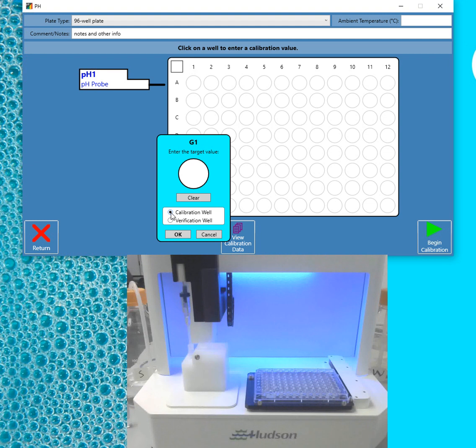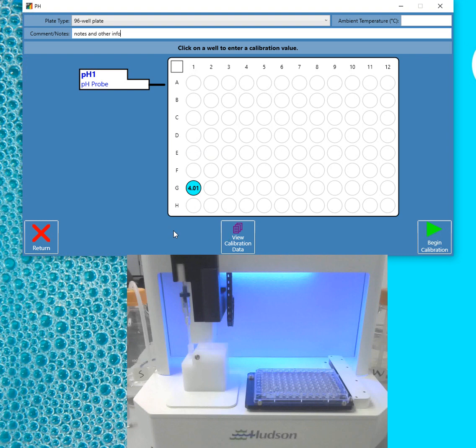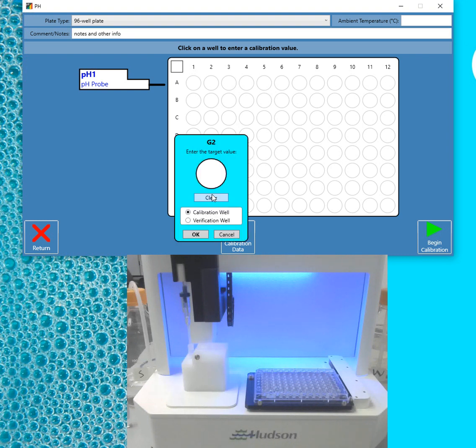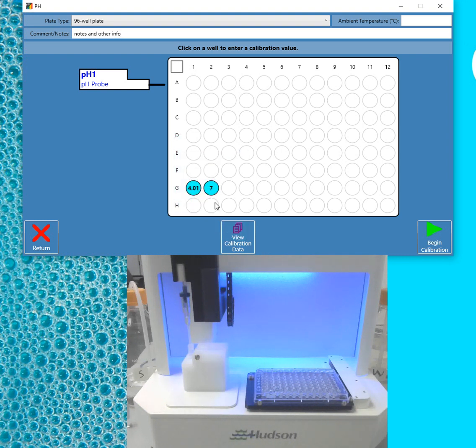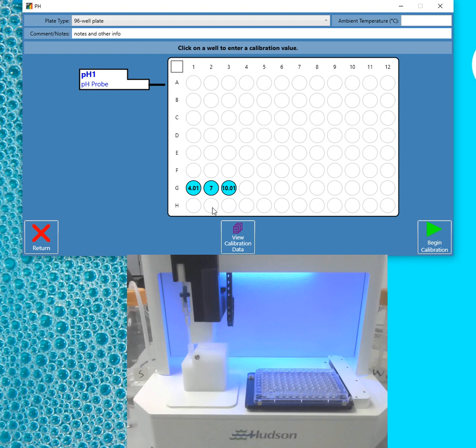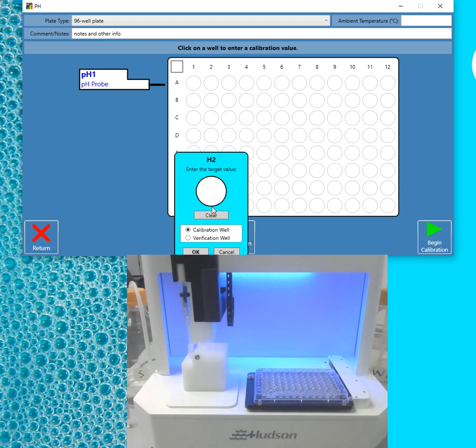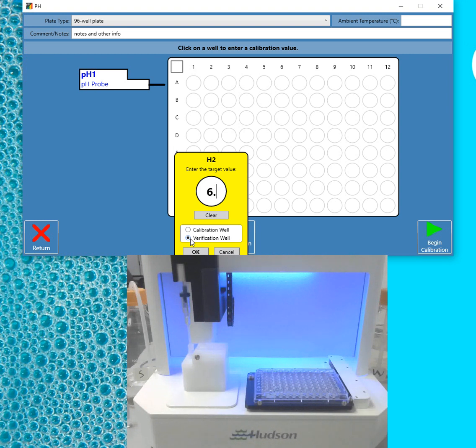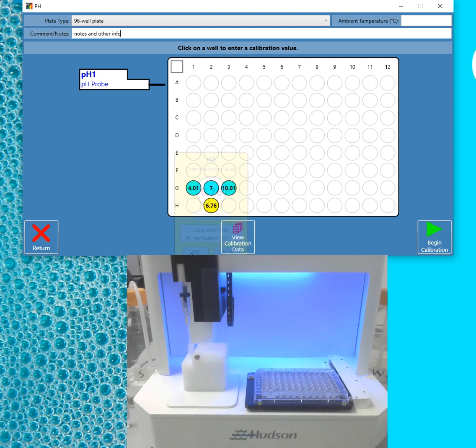I first have to load my pH buffers. And then if you want to use a verification well, you can. Just switch it back to verification well. And I have a 6.76 buffer. Now the Rapid pH is set for calibration.